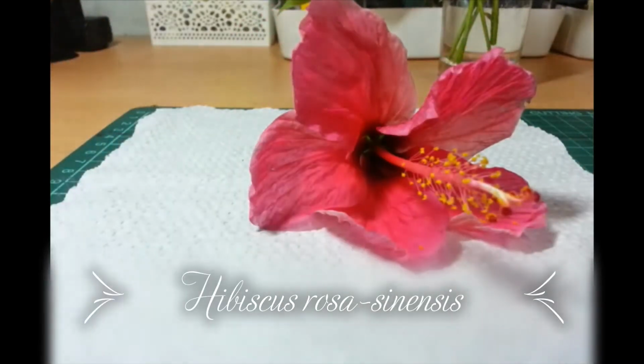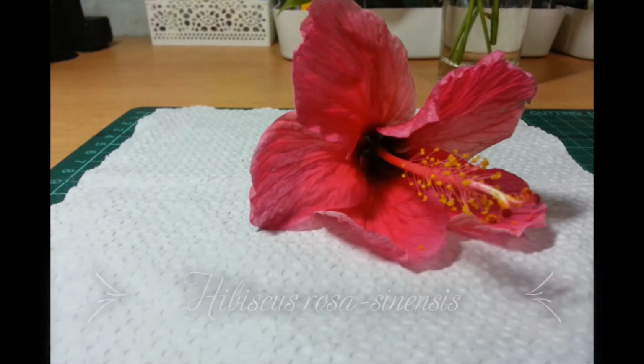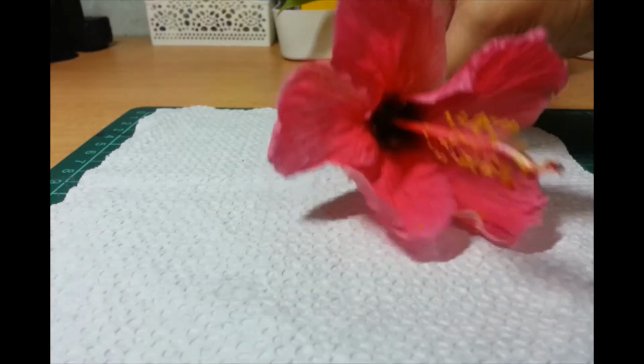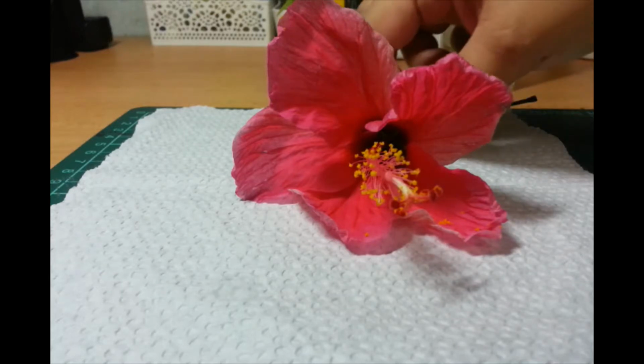So, this is Gumamela or Hibiscus rosa-sinensis. If you look around, there are many variants of it, right? Different colors, different shapes. But we're going to look at this flower in particular. It's a complete flower, and it actually has both male and female parts.